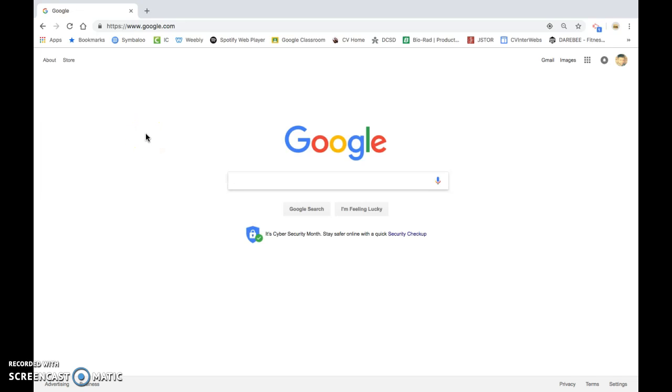Also, what I'd like you to do is, as you're watching the video, you should have your lab notebook with you. Be sure to write down a detailed procedure on how to use this online tool in your lab notebook. This is something that you're going to want to have for reference in some of the projects that you're doing, but also in the assessment that we have. This is something that you're going to want to use in order to make predictions.